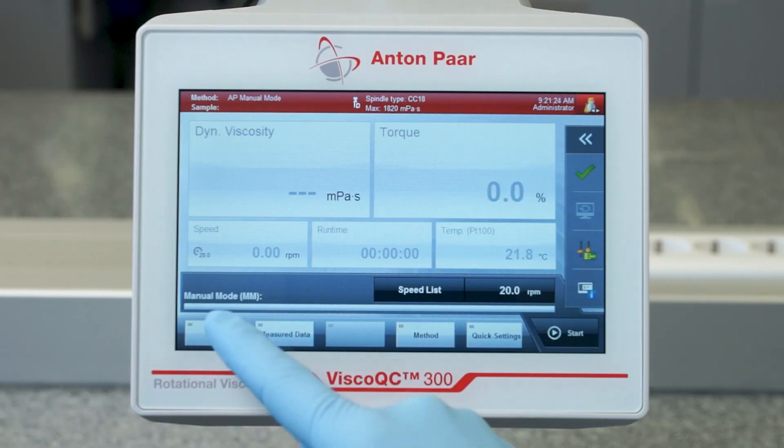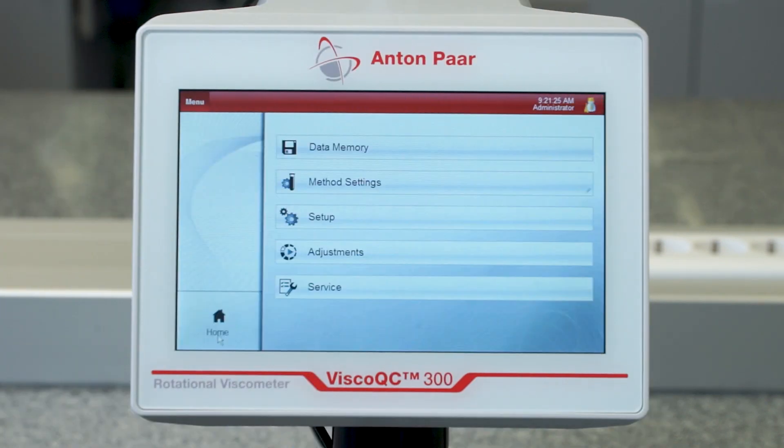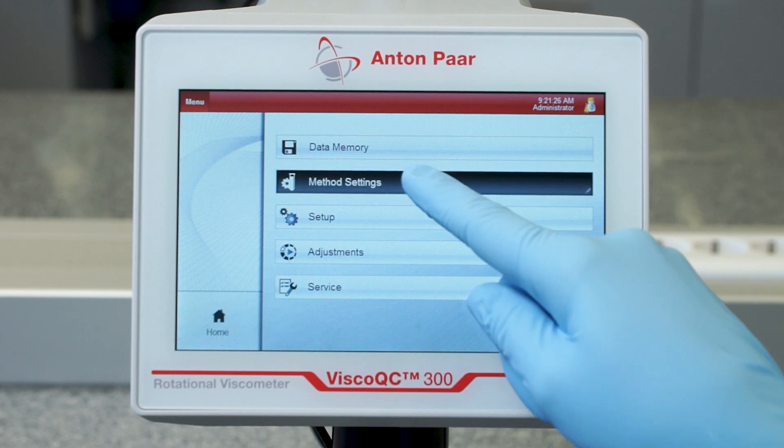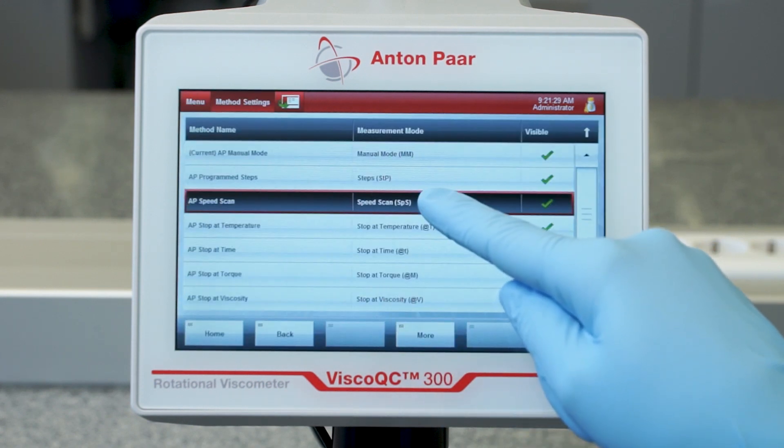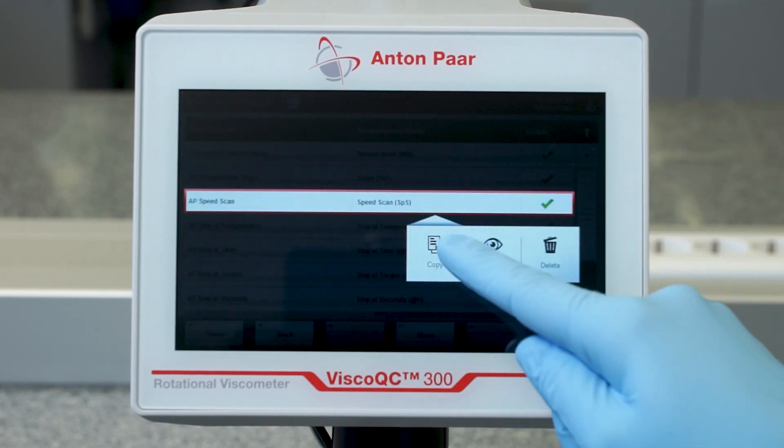You can easily customize your own method by copying a default method, such as the AP speed scan.